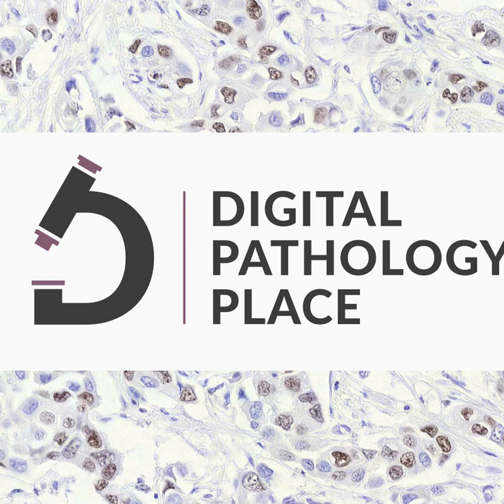We shouldn't do that. Things like mathematical or logical formulas, we've been doing that for a long time, because doing reporting in a structured way enables you to make computations in real time that are safe and very deterministic, and they help save the pathologist a lot of time, right? Other users too, not just pathologists, but there are things that, if we can tell you it's a PT2A based on the size of the tumor and the depth of invasion and all those things, by the time you get to that part of the report, that's already filled out.